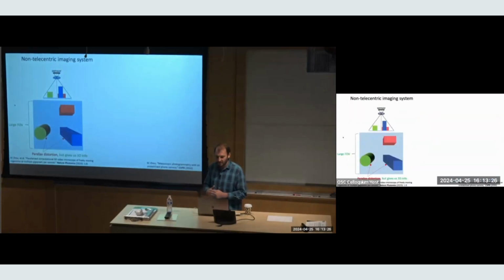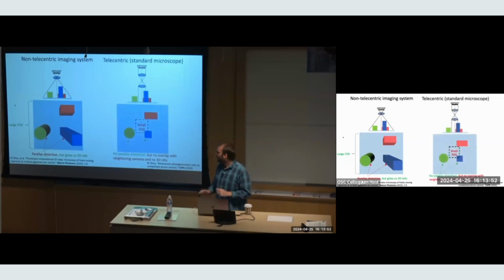I don't really know actually which way to say it. But photogrammetry is really common in imaging in macroscopic settings. There you see images like shown on the left, where your imaging systems are generally non-telecentric, right? So you get perspective, parallax distortion rather, at different locations on the imaging plane. This is different than in most microscopes, where most microscopes are really optimized to be very telecentric. Because when you're observing, let's say, a tissue specimen or something, you don't want it to appear different in the upper left-hand corner versus the middle, for example, during some review in the clinic or something like this.